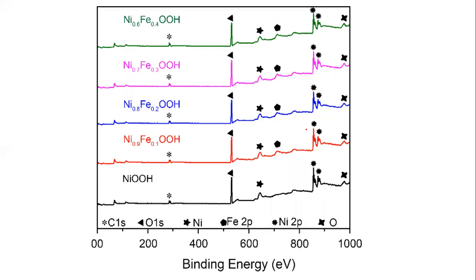Now look here. This is a very interesting piece of information from my research work. I prepared a compound that is nickel OOH. Then I added iron to this compound. Basically, these are nano sheets of nickel OOH. And when I incorporated iron in those nickel sheets, of course I cannot see iron with my naked eyes. How can I see that iron is inside that sheet or not?